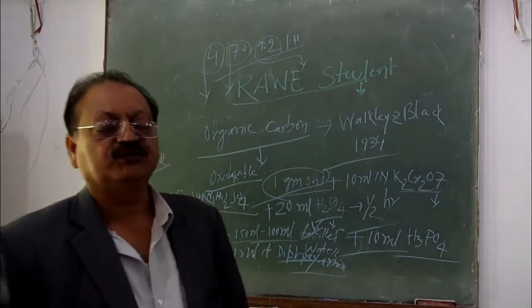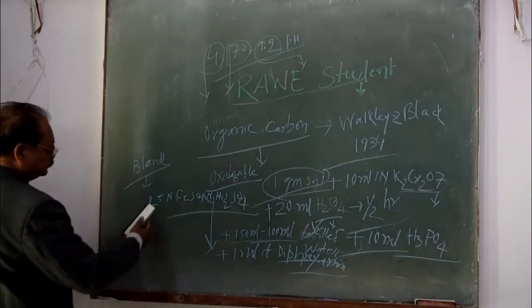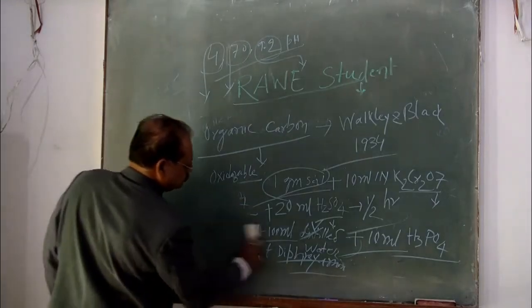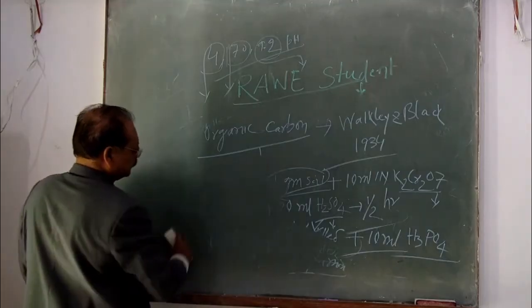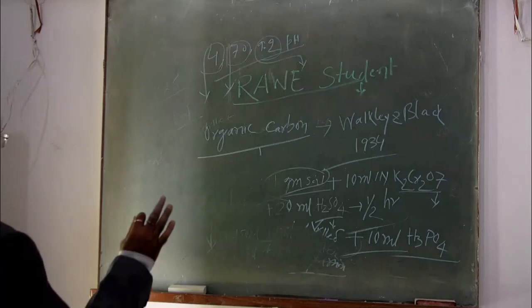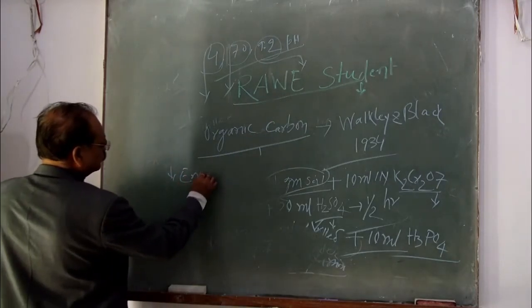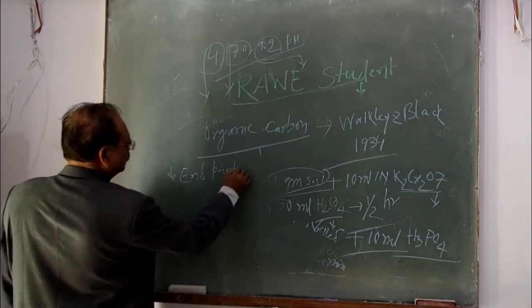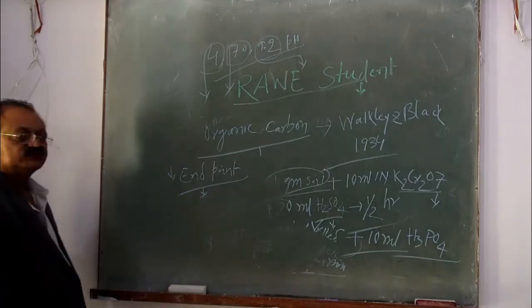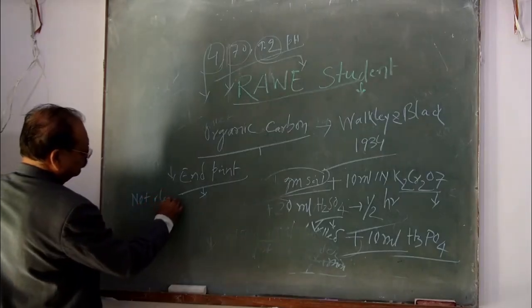After titration, take the reading of the end point and note it down in your notebook.